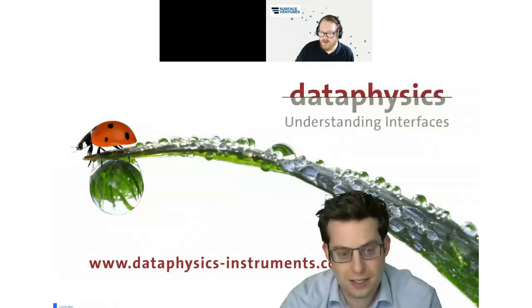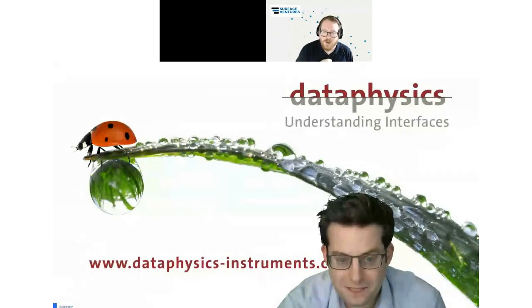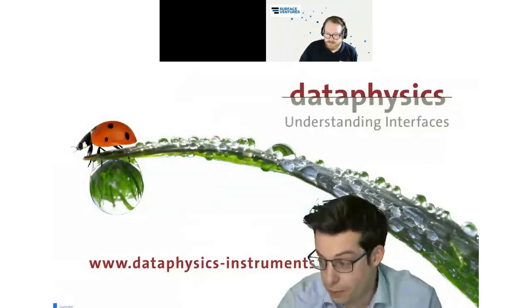And then final question here. An extreme case of super hydrophilic or super hydrophobic leads to a 0 or 180 degrees as well. Will that be hypothetical ones? Can you comment on the uncertainty involved in measurements as well as in calculations? Yeah, so maybe a very short comment.